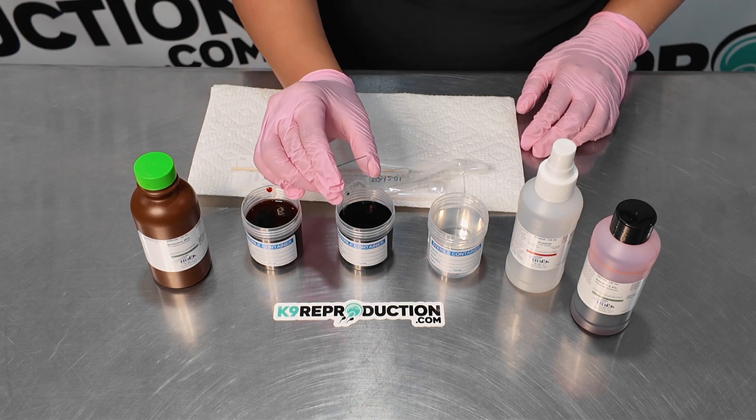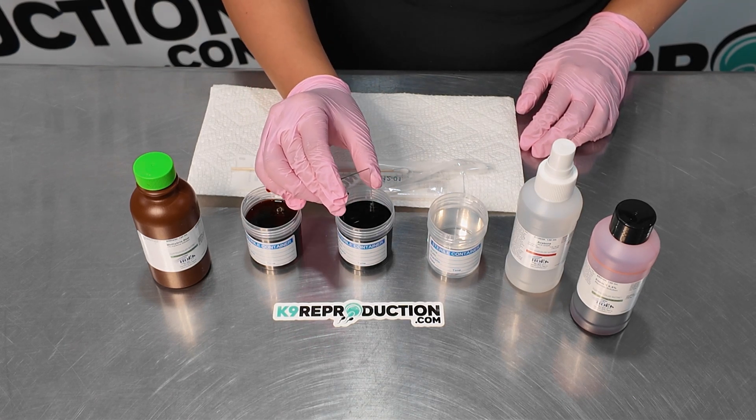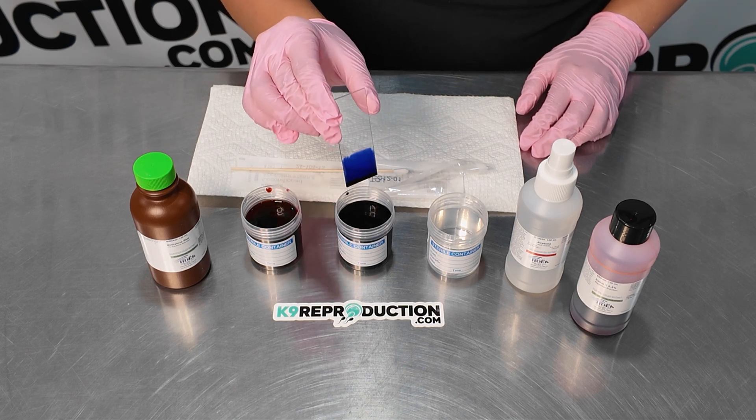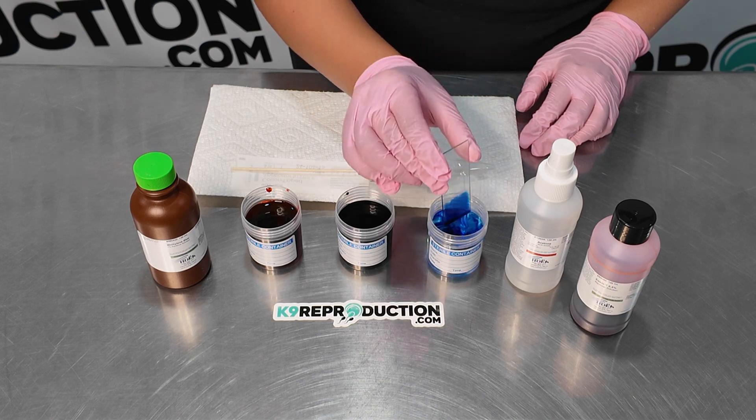Next, we'll move to the methylene blue. Dunk the slide in the second solution for 10 dunks or up to 10 seconds. Finally, finish by rinsing the slide in the water with four dunks or up to four seconds.